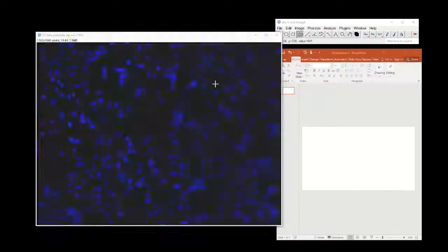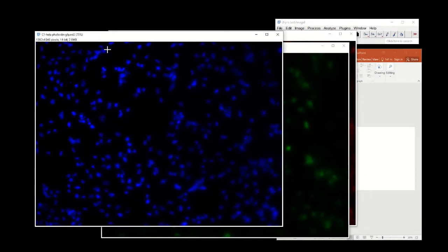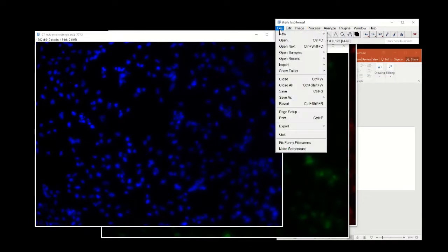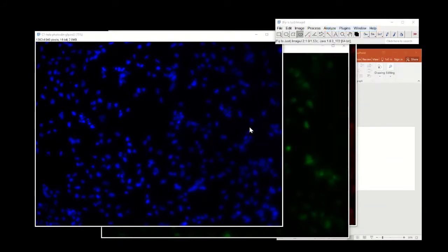Sorry, right here, color, split channels, and I have these 3 channels. I'm going to save them individually now. So I'm going to go to the blue one, and I'm going to do save as. Again, TIFF is better, but I'm going to save it as JPEG for now. So this is my C1, this is my blue channel, and now I can close it.